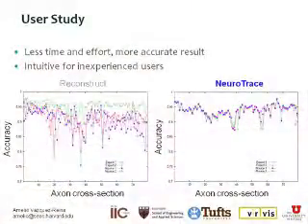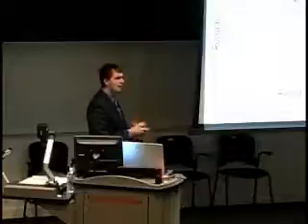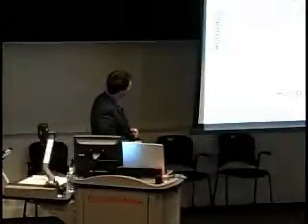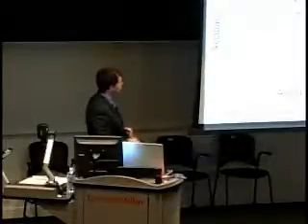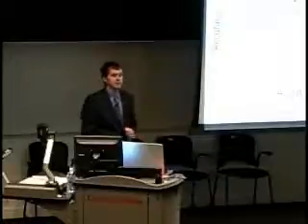We also conducted a user study with the undergrads in our lab, and we got very positive results. Here you can see the accuracy of the segmentation done by a variety of users. With Reconstruct, which is the first tool I showed you in the talk, you can see that the accuracy of the segmentation varies strongly. This is with respect to the ground truth of an expert user. With NeuroTrace, we get more consistent and, on average, better accuracy on the segmentation.